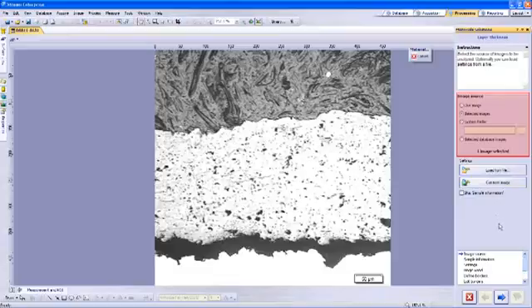Once the Layer Thickness window opens, it will start with the image source selection, the option to load settings, and the ability to skip the sample information section. At the top of the window we have instructions that will guide us through each screen, and at the bottom we will have the workflow list of this solution.